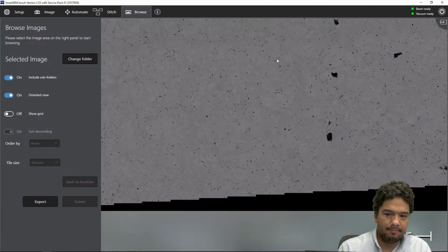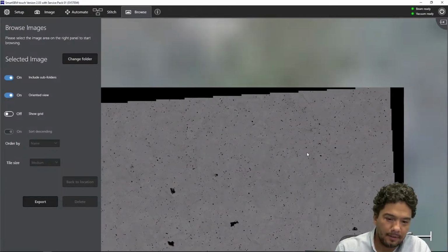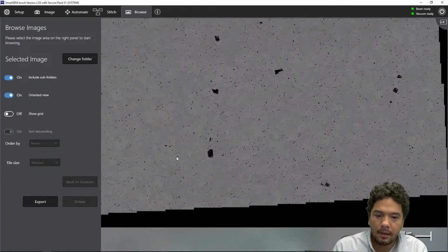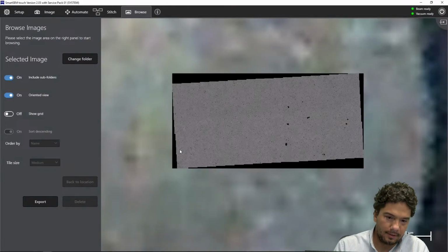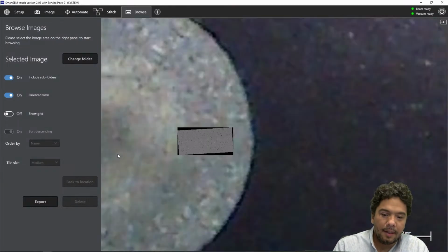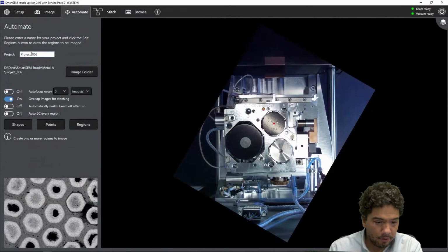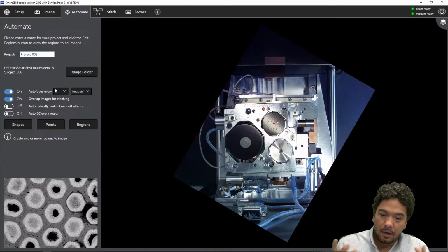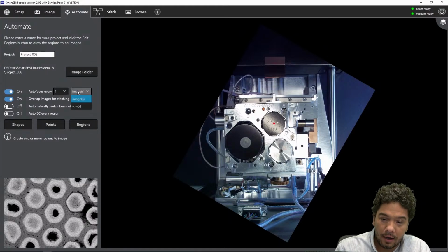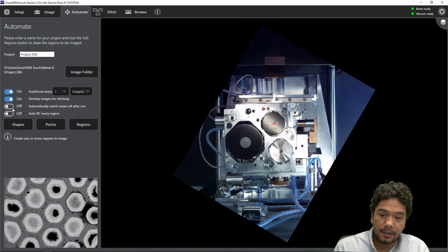And that's pretty much it. I mean, of course, this took a while. I only sped up the part of the image acquisition, but the rest of the workflow is really seamless, and that is, of course, very nice for day-to-day operation for big tiles. This is another example. For example, if you are working with samples that look very similar, this is a very good example. Here we have a superwire with three different sections of this sample.